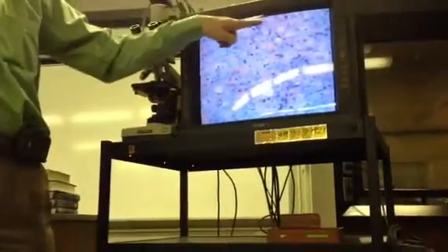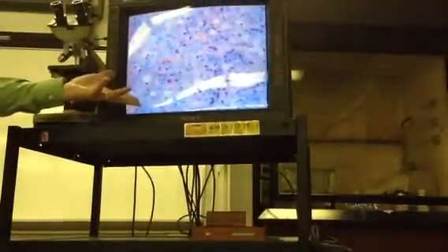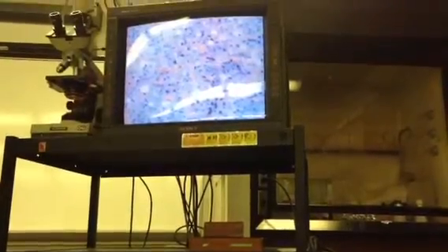But anyway, you can see these capillaries, this sort of parallel array of capillaries with these cells in between, and also notice they have all these lipid droplets. When you see a lot of cells with lipid droplets, and it's not adipose tissue, which of course is very distinct looking, that tells you that you have a cell that does what? Makes steroids. Because that's its supply of cholesterol there in those lipid droplets.